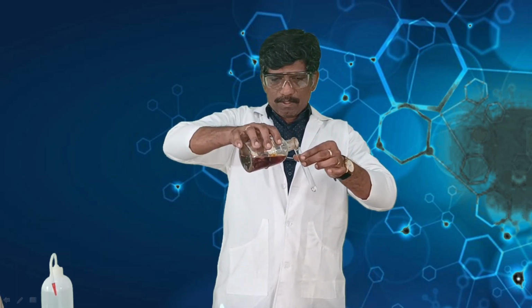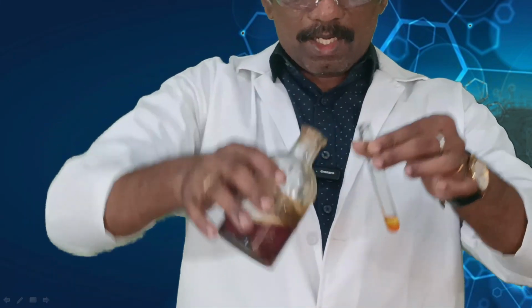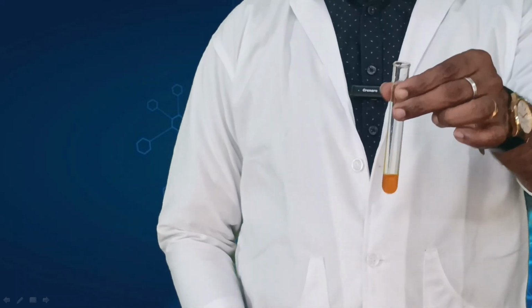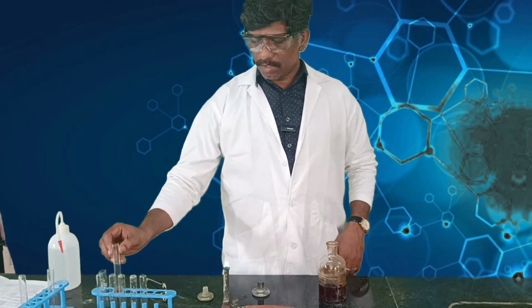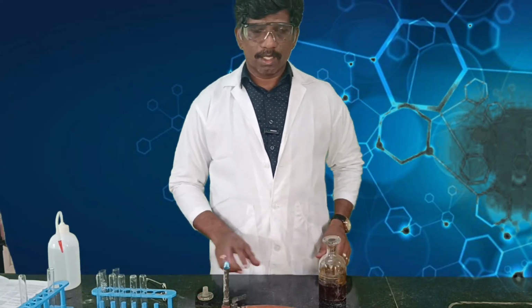The formation of a yellow color precipitate shows the presence of aldehyde or ketone. Both will give a positive test. We will distinguish whether the compound is aldehyde or ketone using Tollens' test that we will see later.